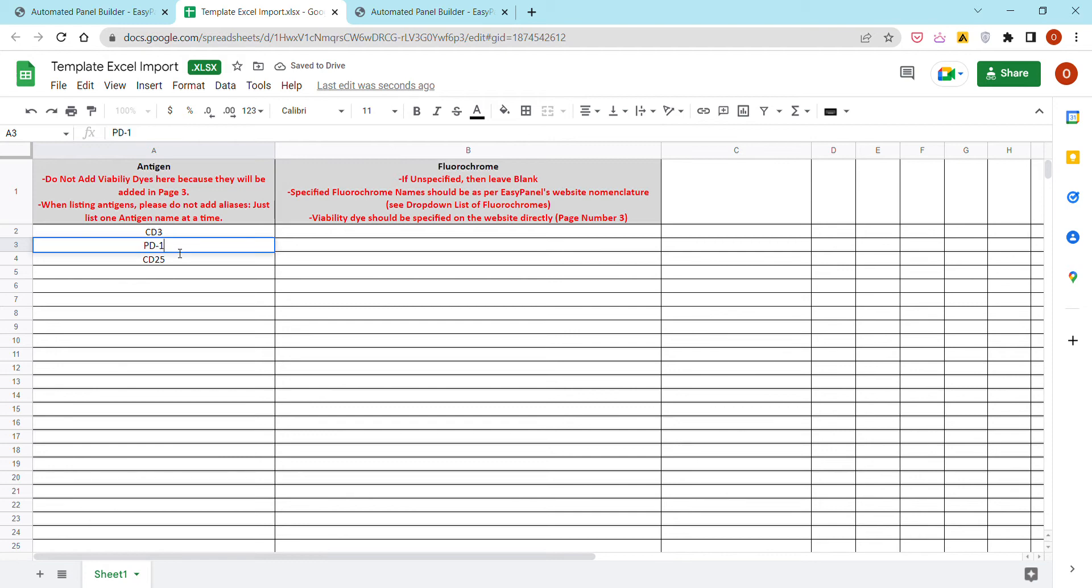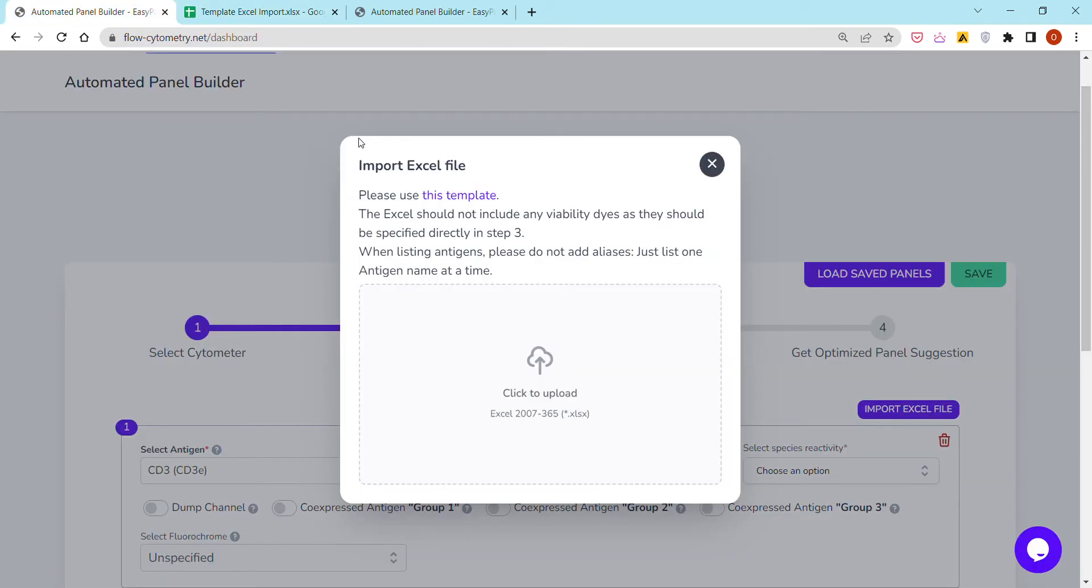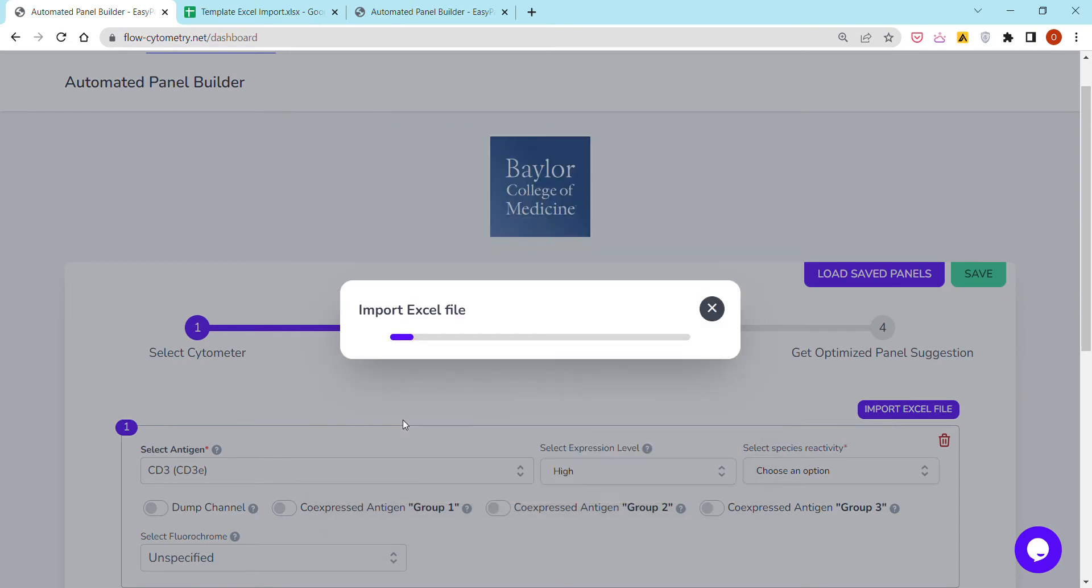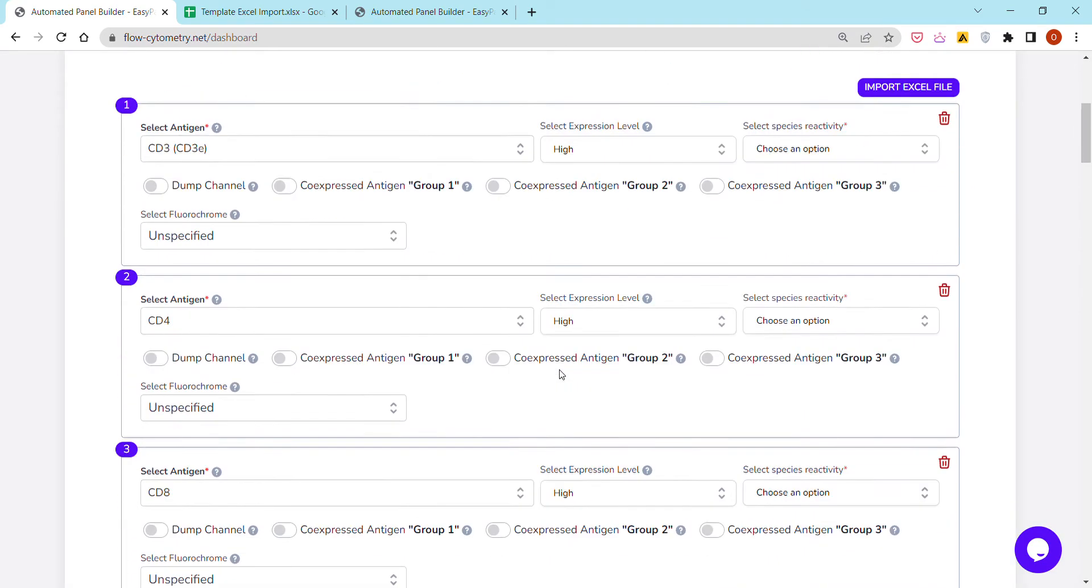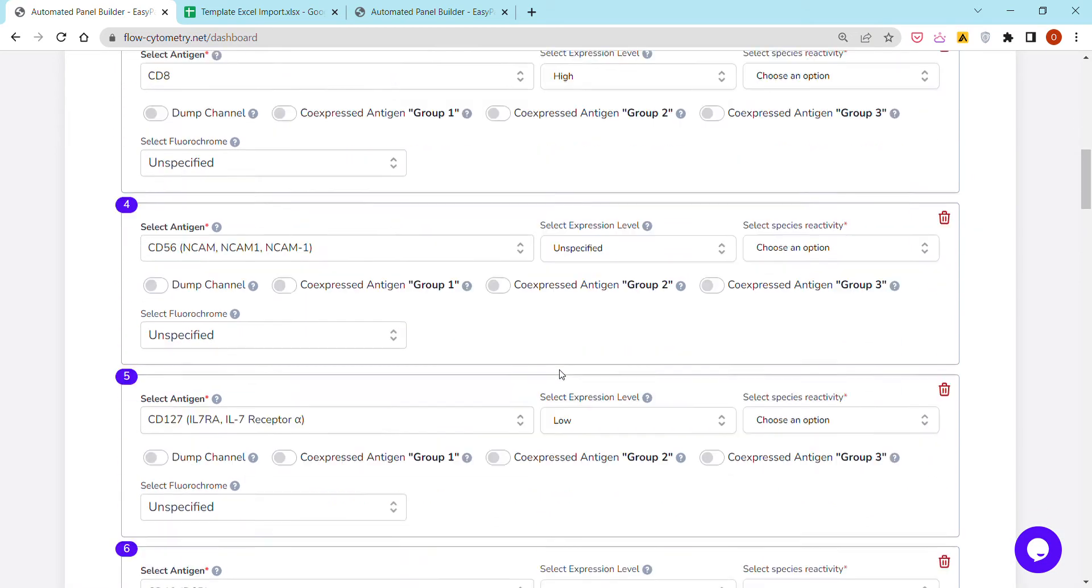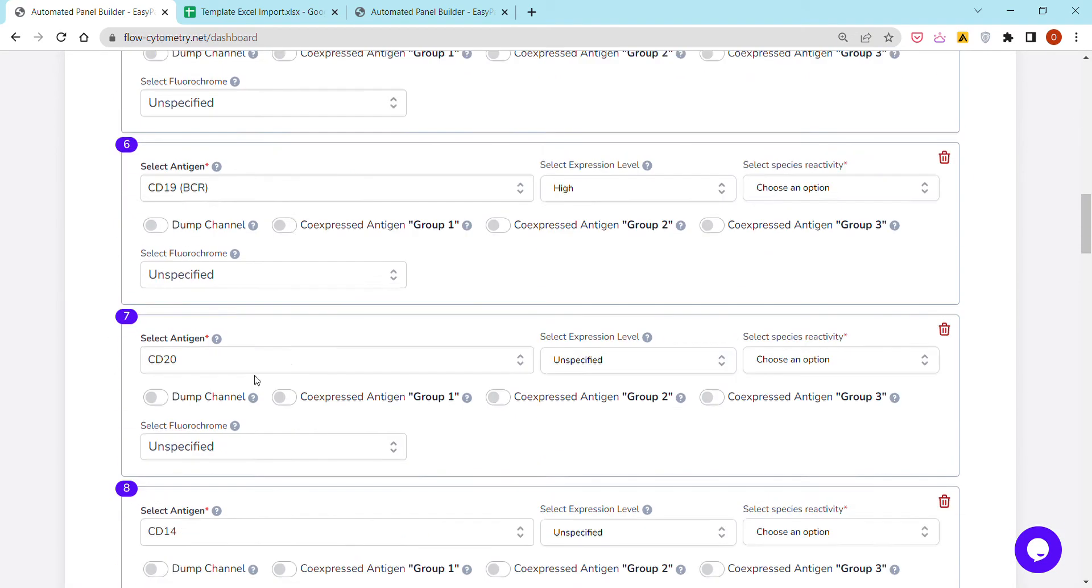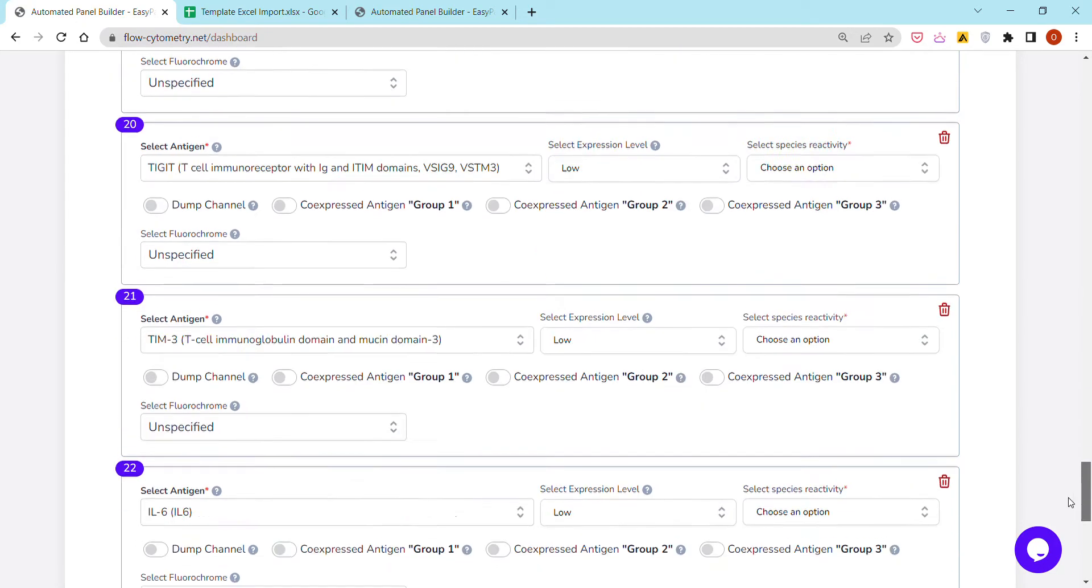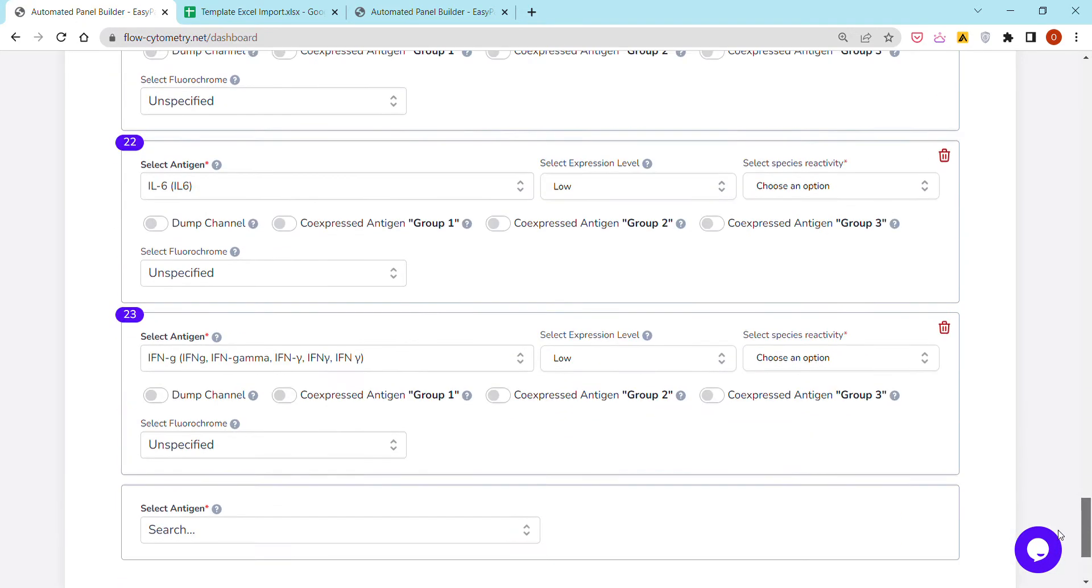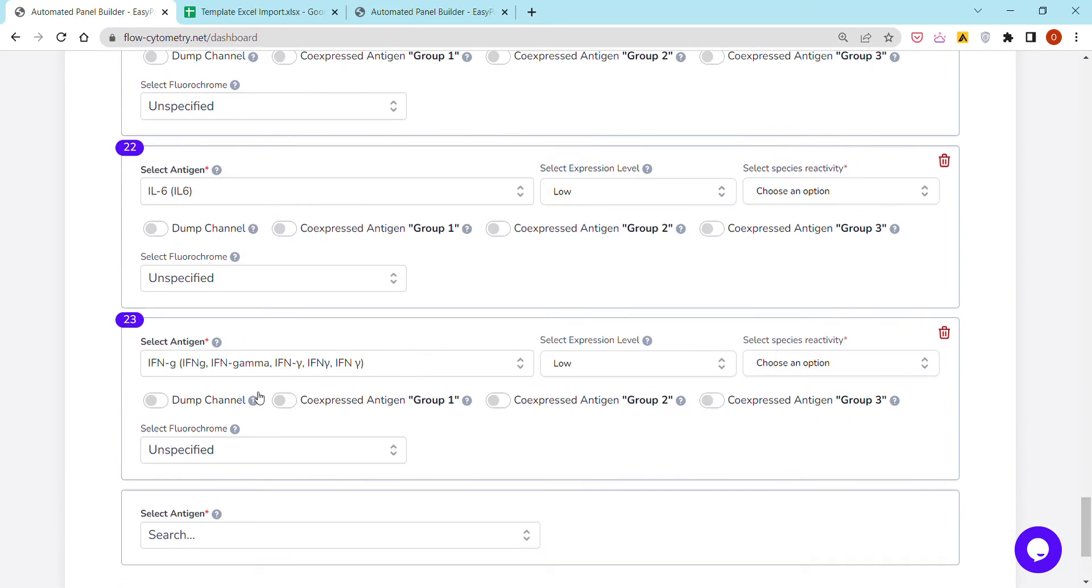I already have a panel that I can upload. It's an Excel file that I've just uploaded right now. As you've seen, it's a T-cell panel with about 23 antigens.